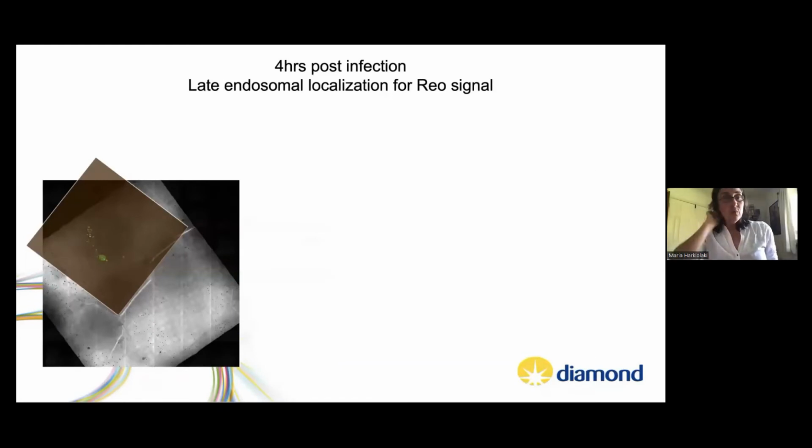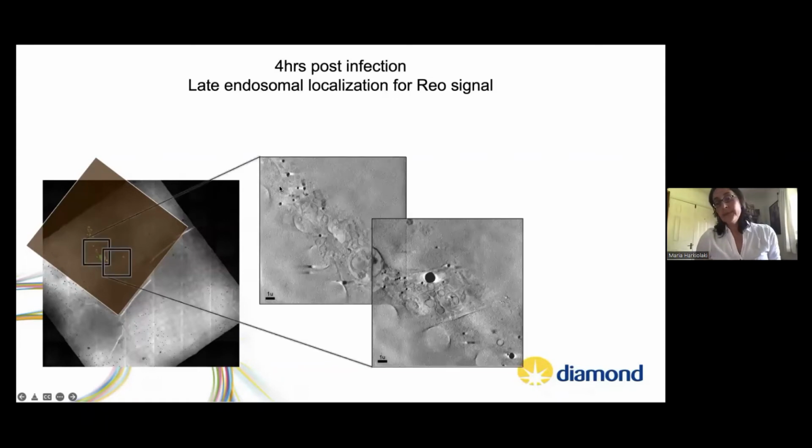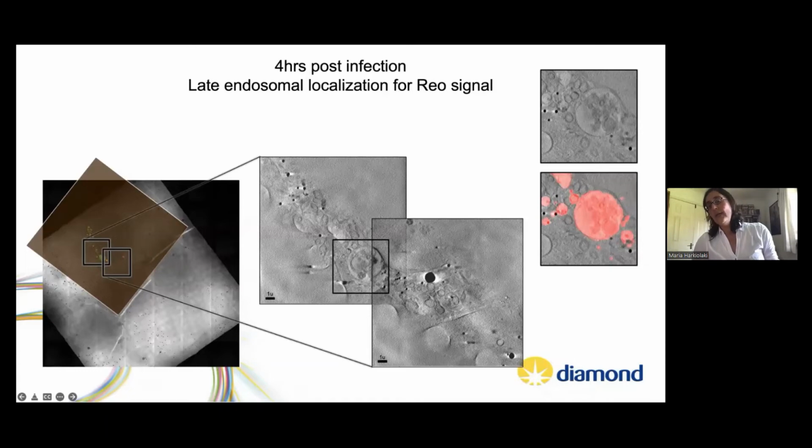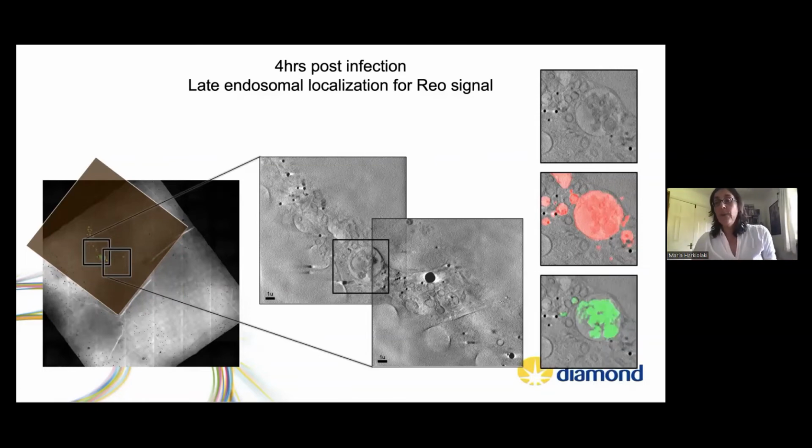As an example, I'm showing you one of the 4 hours post-infection when you have the X-ray data and you superimpose the fluorescence. There was a huge curve in this cell, so we're only looking at a thin area. The nucleus is on the top here, and then you're seeing lots of vesicles. If we focus on this pretty large vesicle, this is a late endosome, most likely recycling, but we were able to decipher very cleanly from the galectin signal that this vesicle was leaky. Somehow all this galectin managed to be siphoned in, but it also contained the debris, basically the remnants of the original virus capsids.